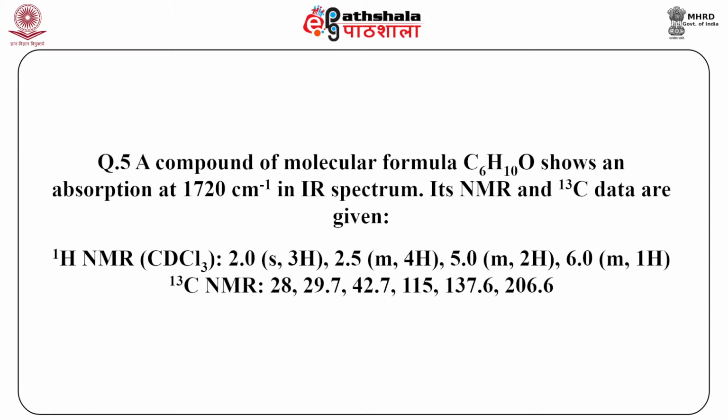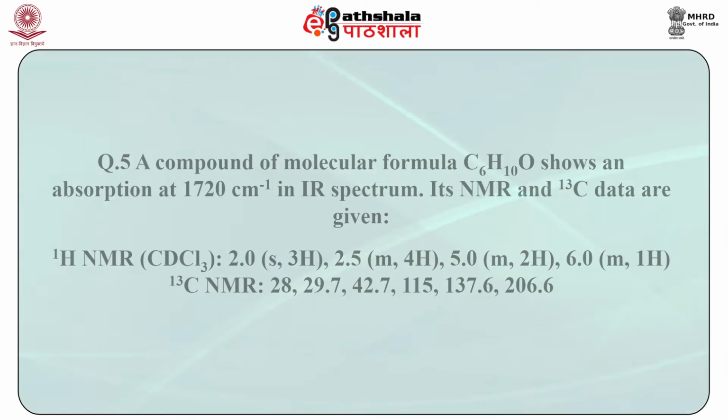The carbon-13 NMR shows 28, 29.7, 42.7, 115, 137.6 and 206.6 ppm values.